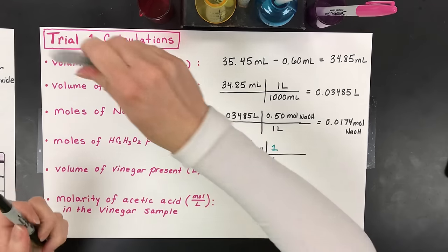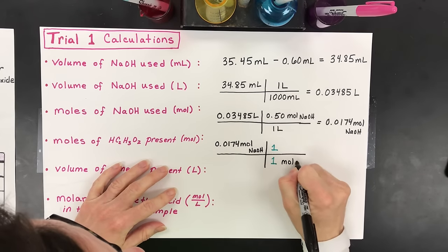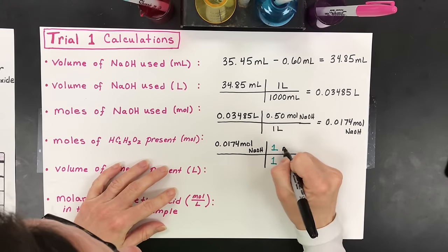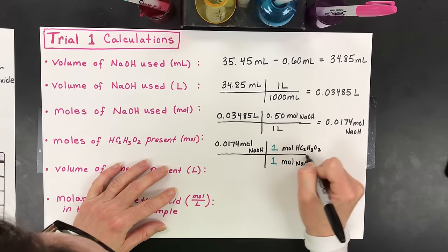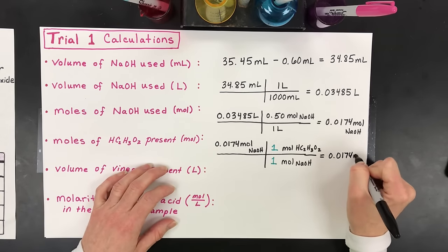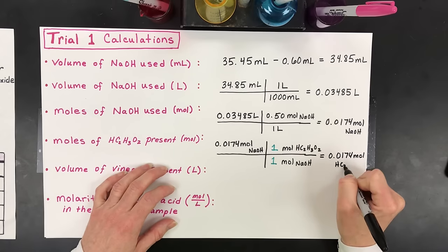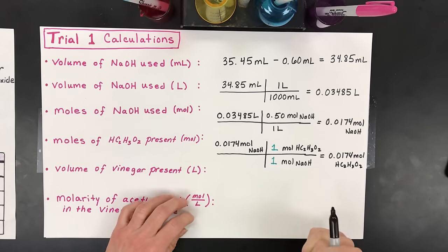There's my mole ratio of the sodium hydroxide to the acetic acid, so moles of NaOH converted to moles of acetic acid. Not every reaction has one to one. We just kind of got lucky this time, so 0.0174 moles of acetic acid. So they have the same mole amount. That's what I neutralized with my titration.